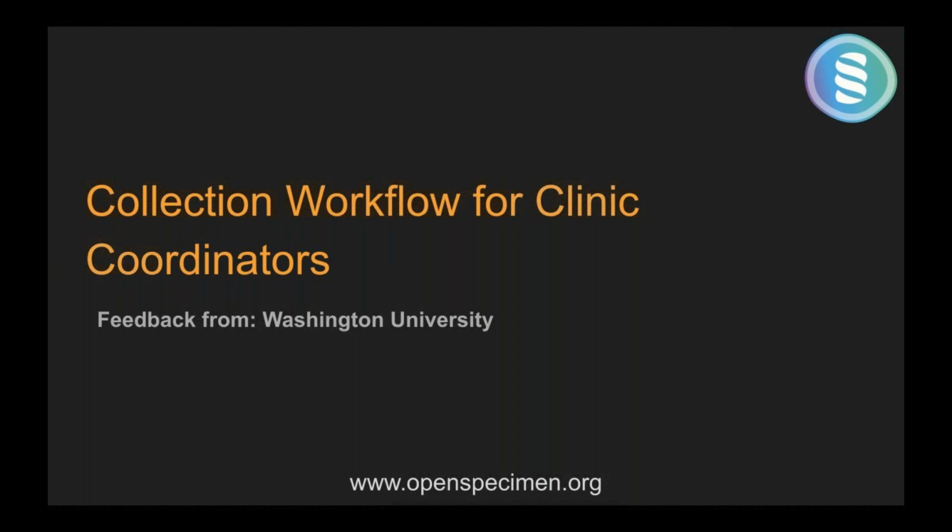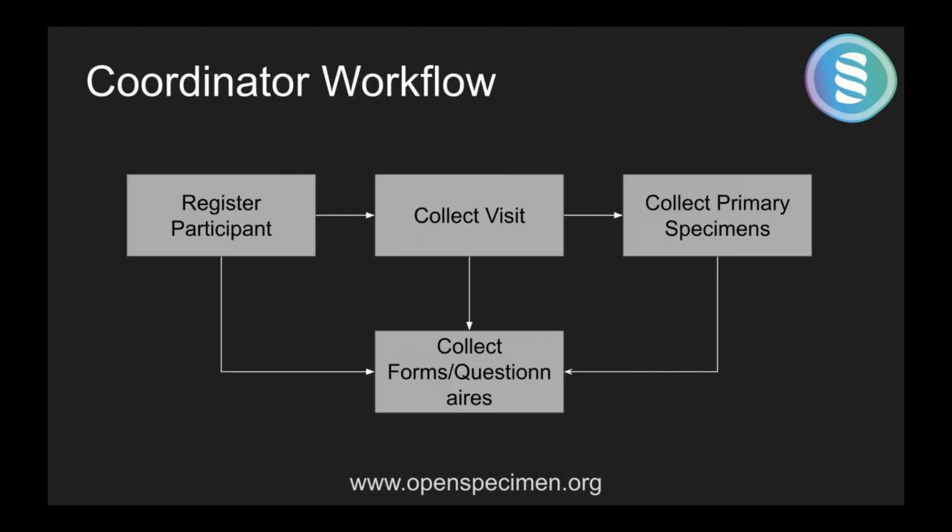Let me start with the collection workflow for clinic coordinators. So what is a coordinator workflow? They register participants, and there may be some forms, some of this being optional. They might have forms or questionnaires and consents that they collect, and they collect the primary specimens.